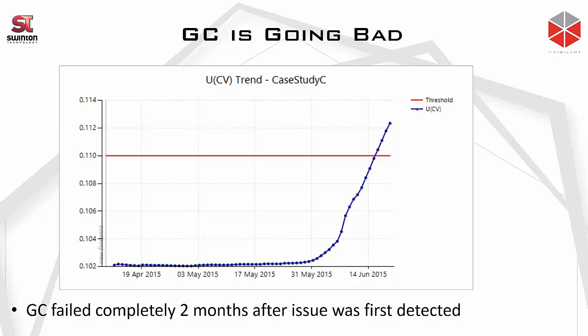GC measurement of methane is capable of so much better than plus or minus 0.1%. So we can understand the actual uncertainty of the GC by using this method, rather than assuming quite a high uncertainty of the GC.